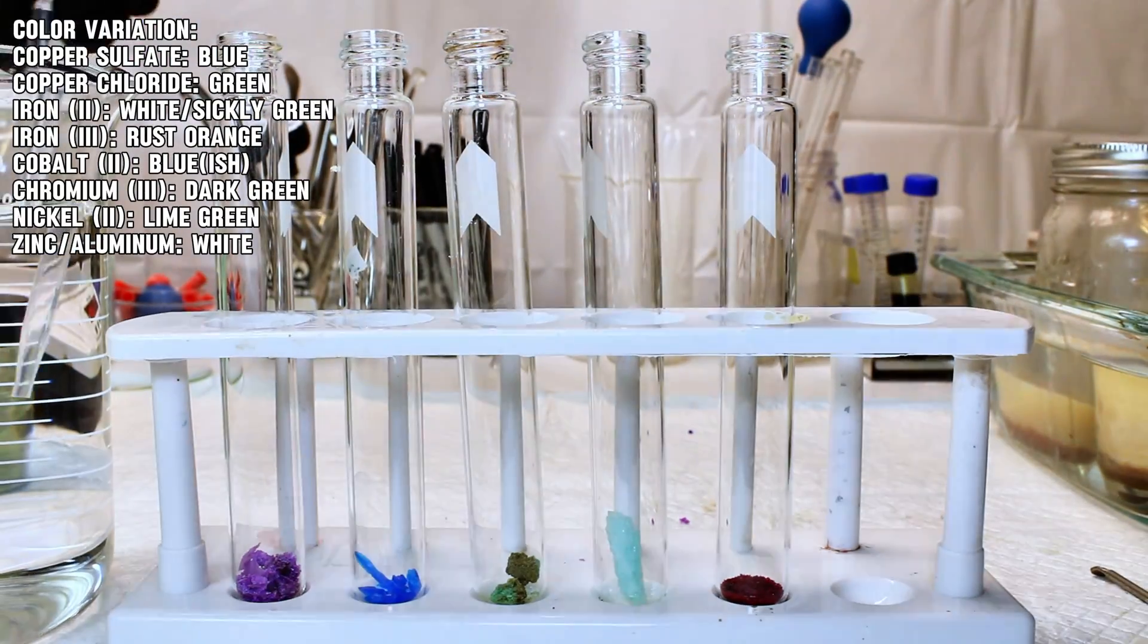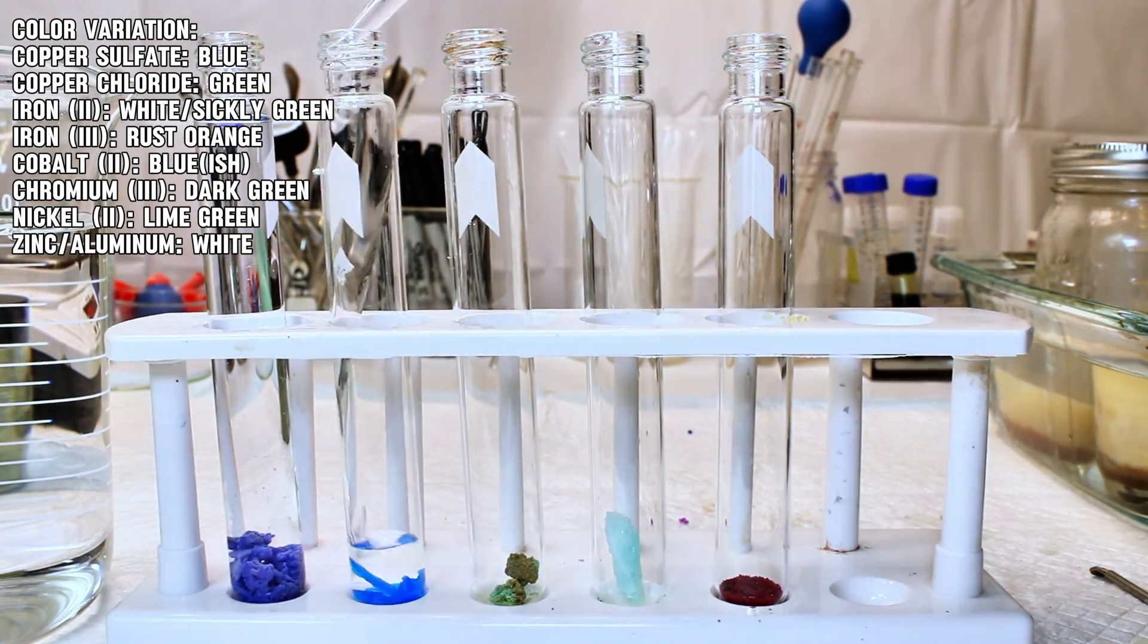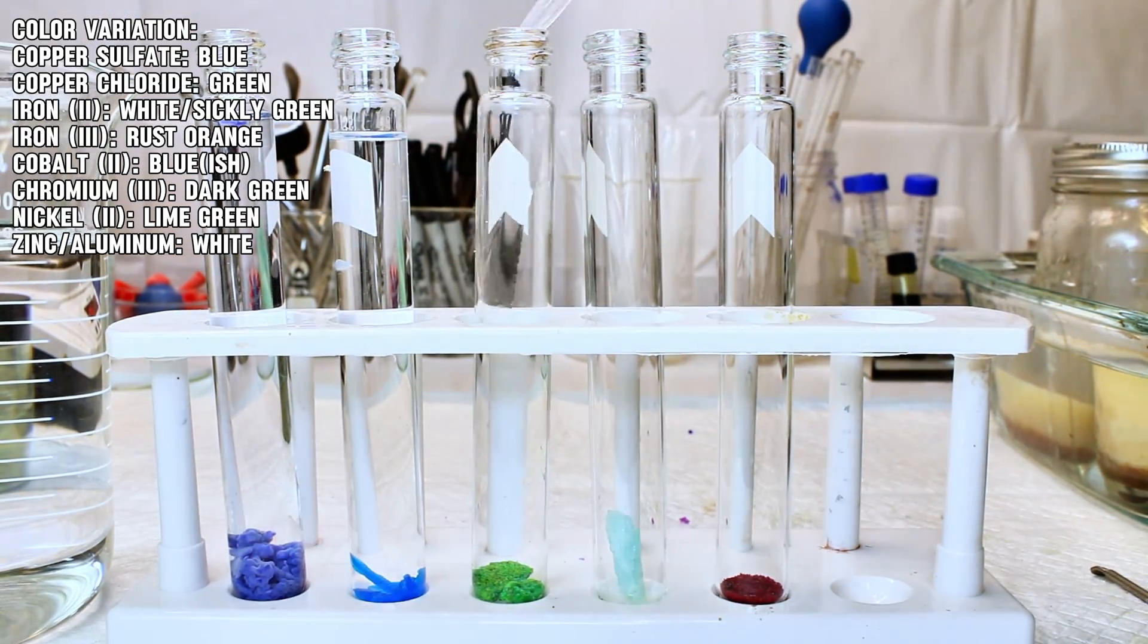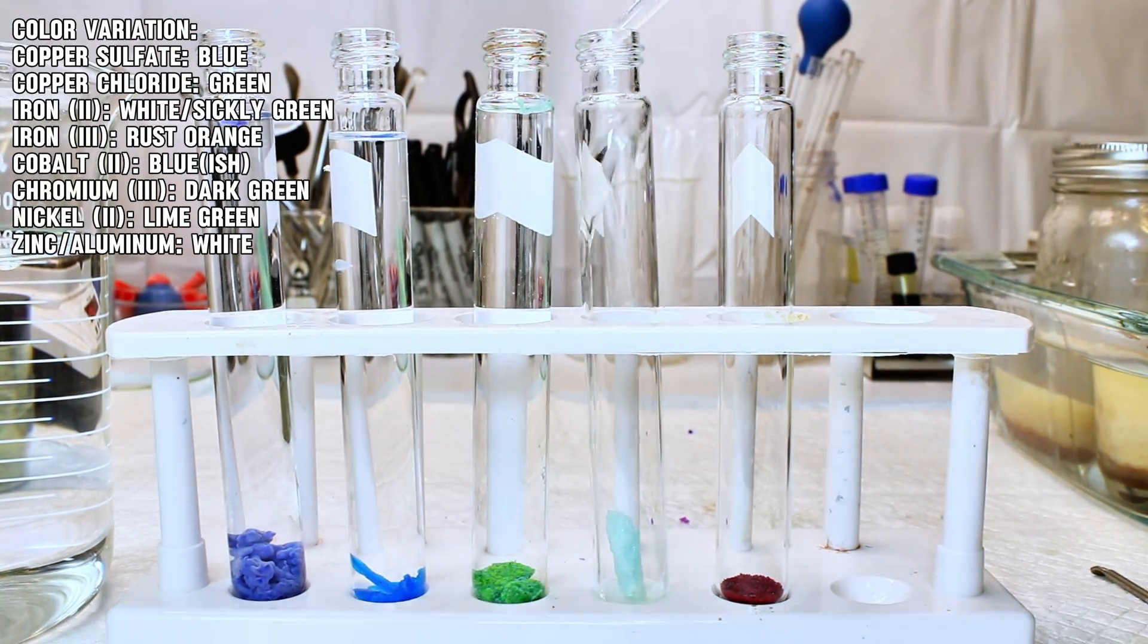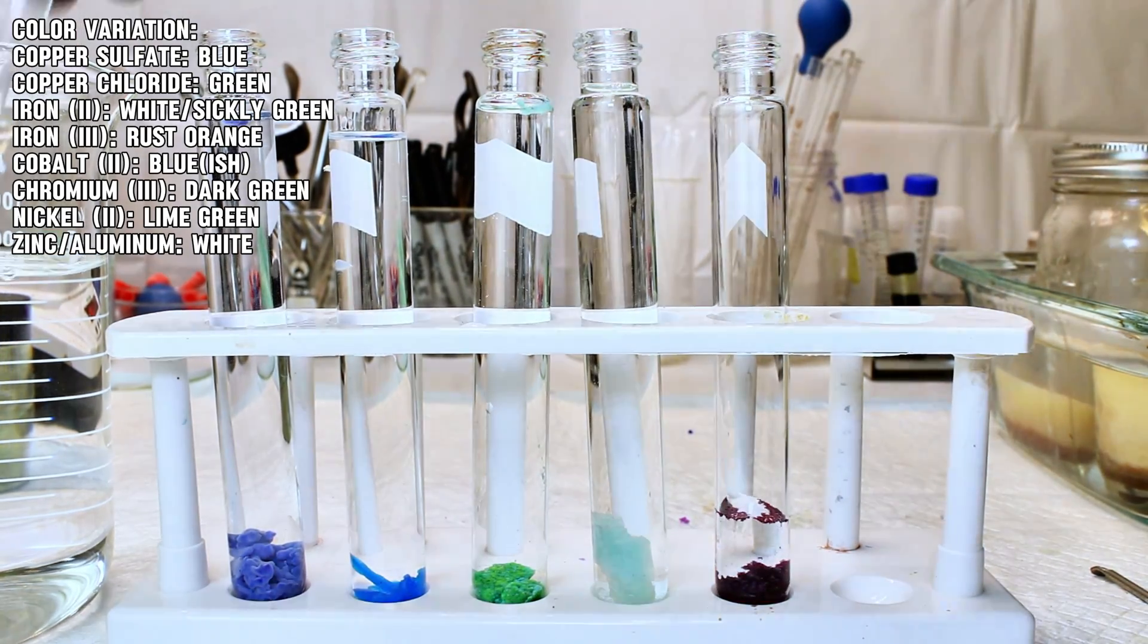Copper sulfate will form blue growths, copper chloride will form green. Iron sulfate is more of a sickly green, while iron chloride is a rust orange. Cobalt is usually dark blue, chromium is dark green, nickel is lime green, and zinc and aluminum are white.